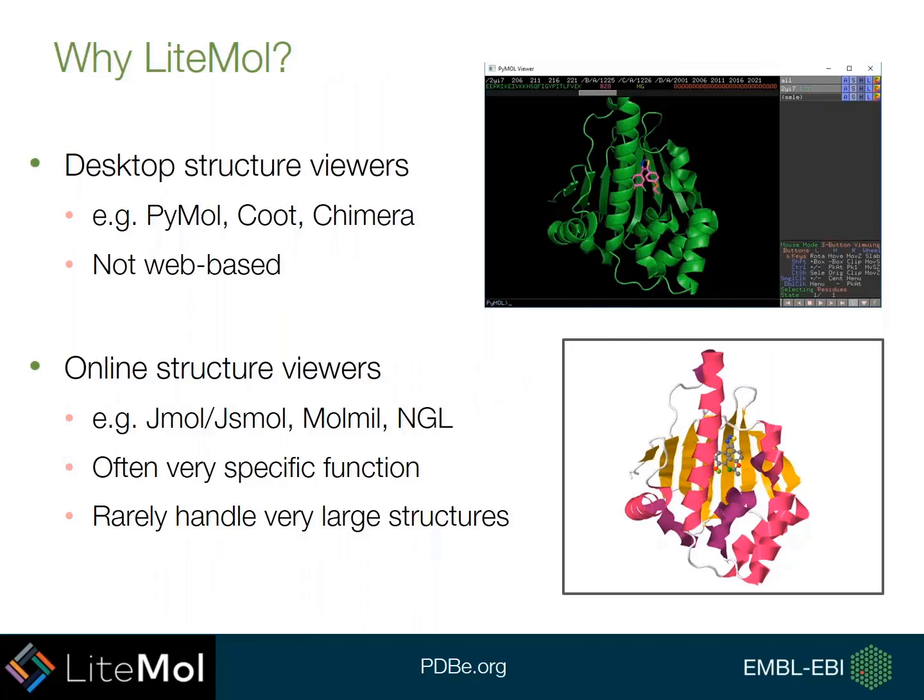So why might you want to use LiteMol? Well, there's obviously a plethora of different structure viewers, and there are a number of desktop structure viewers that are very powerful, such as programs like PyMol, Coot, and Chimera. The main problem with these is that they aren't web-based. These require download onto your desktop.